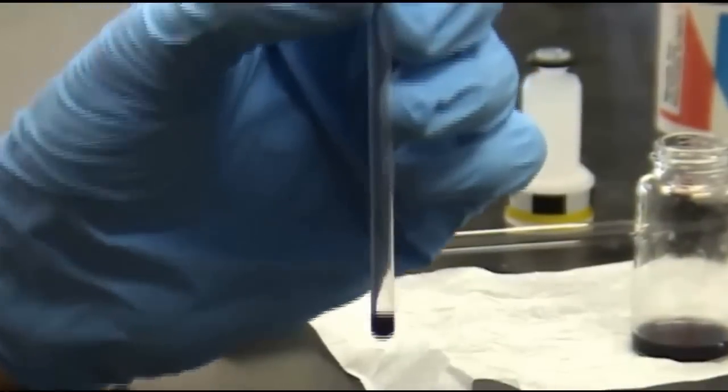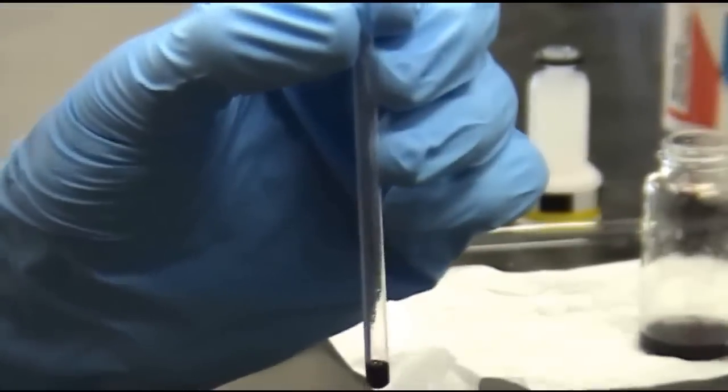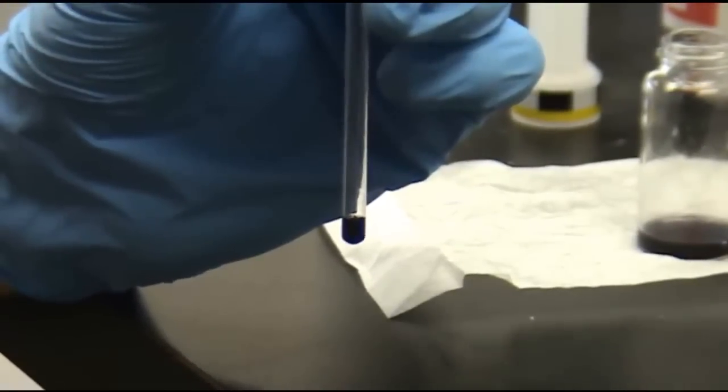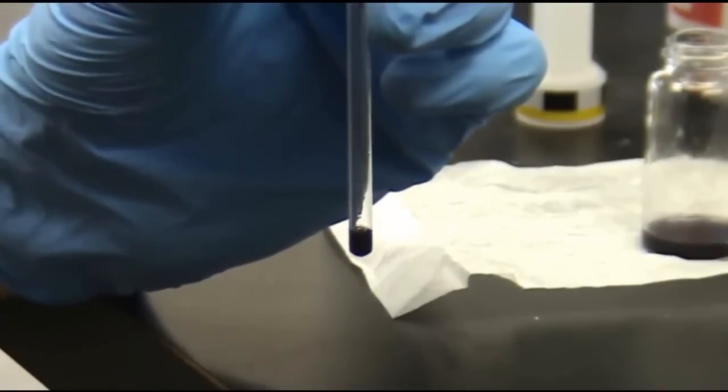Next we'll need to add deuterated solvent. In this case, we're using chloroform. Using a clean Pasteur pipette, add enough so that the height of the liquid in the tube is about four centimeters.